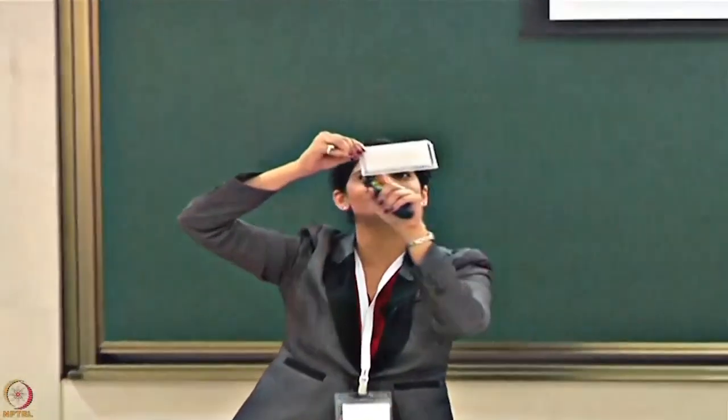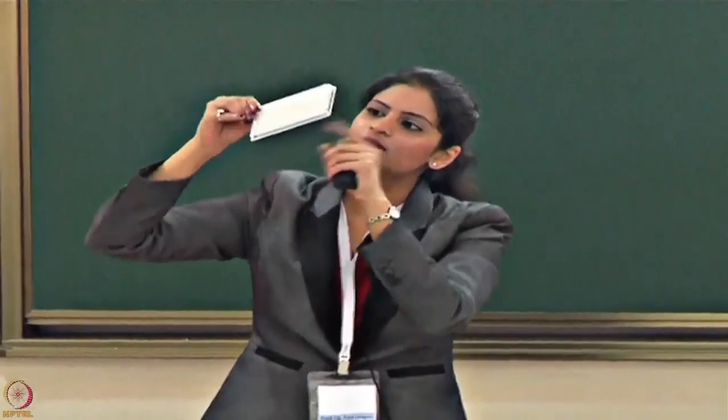If you fill all the wells, sometimes the human eye cannot really see if all the wells are full or not. I have had my own experience where, with pipetting so many different samples in the 384 style, if you miss one well and you put that plate in a reader, what's going to happen to that one antibody? It's not going to print. It's not going to get picked up. It's not going to get detected. So you've missed the whole set. You'll have to go back, fill it again and start.